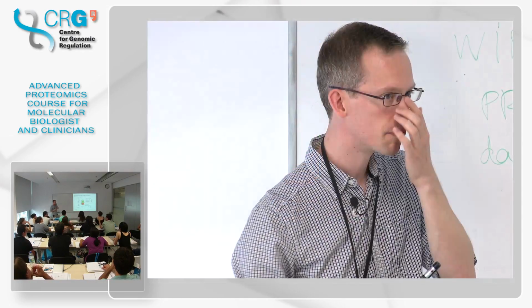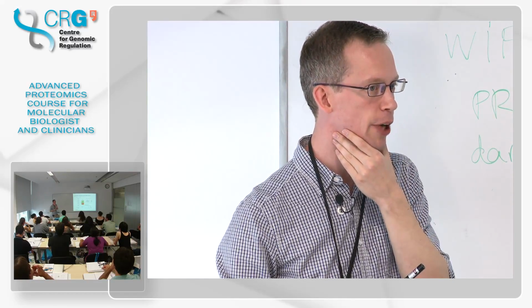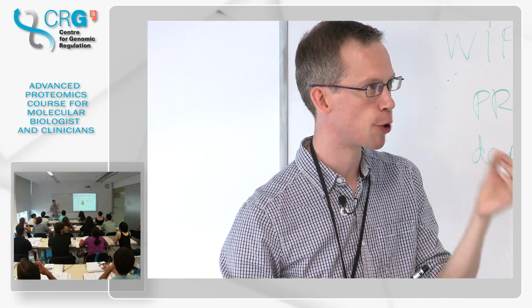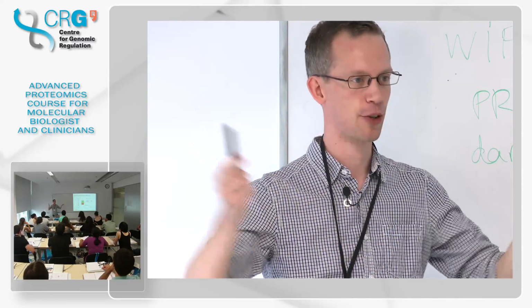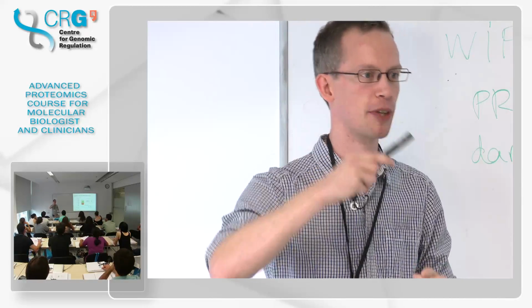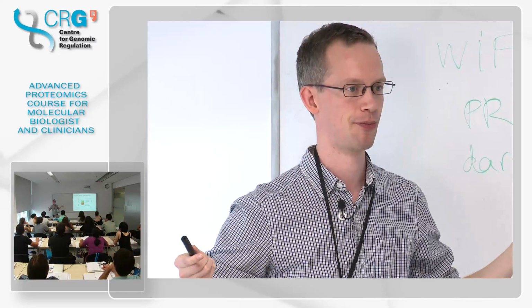Is this for normalizing the size of the peptide? No, this is to solve the problem that the expectation value is very nice to use for one spectrum, but you want to have something that works for all spectra at once. So you don't do this multiple hypothesis testing where you test each spectrum individually. You want something that works on a population of spectra.